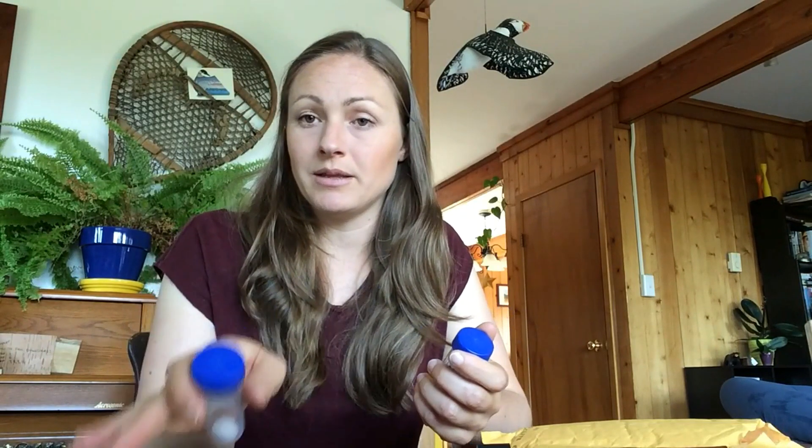This is going to be important when you send in your samples. Also, we are trying to get people to take a photo of the habitat, and you can email in that photo when you're done. Again, that's all in the instructions in the package.